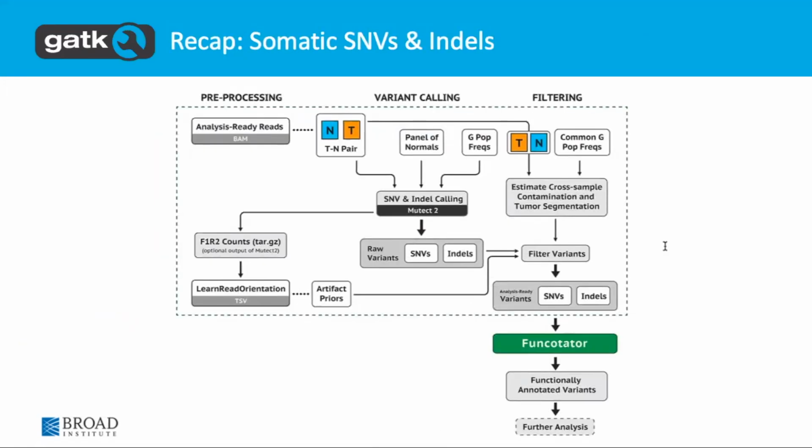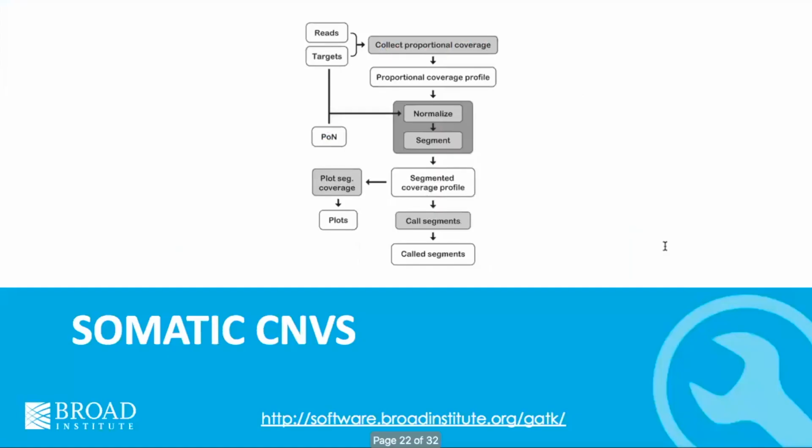Okay, so this is the big Mutect2 pipeline, which we'll discuss in more detail on day 3. It has other details that I haven't mentioned for doing more intense filtering and also figuring out cross-sample contamination. So we will discuss that tomorrow.